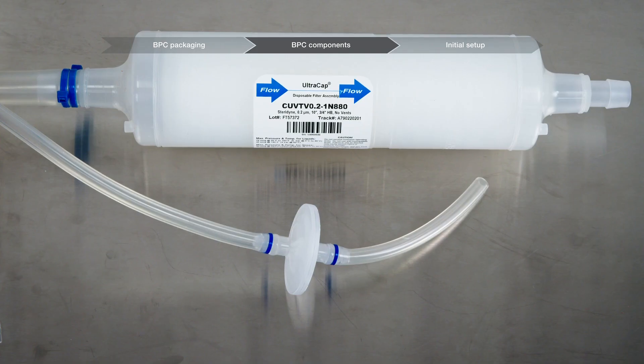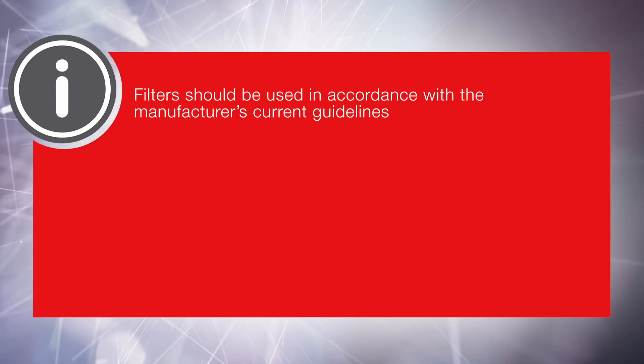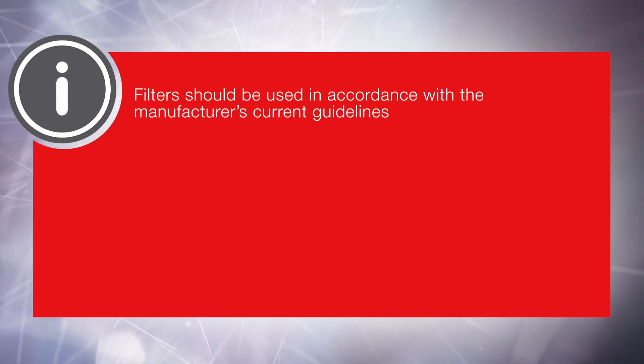BPCs may come with filters. Filters should be used in accordance with the manufacturer's current guidelines.